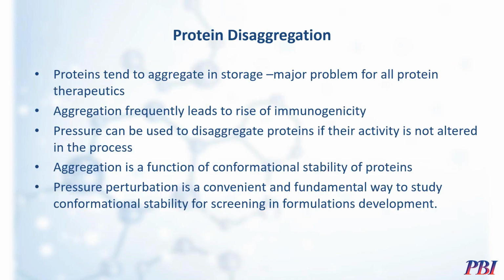By analogy, protein aggregation is another major problem in the biopharmaceutical industry. Protein aggregates tend to be immunogenic, leading to drug inactivation and unwanted adverse reactions in patients. Pressure could be used as a convenient tool for protein disaggregation. From biomanufacturing to formulations, accelerated stability studies can be carried out to determine whether the protein is happy in a specific chemical environment, or it is about to form fibrils or highly immunogenic aggregates. Understanding the mechanism of protein aggregation can help to develop formulations that favor protein stability.